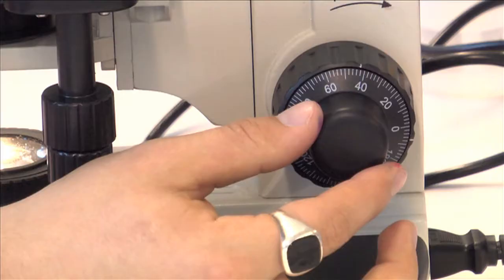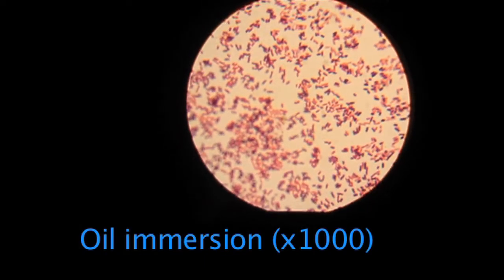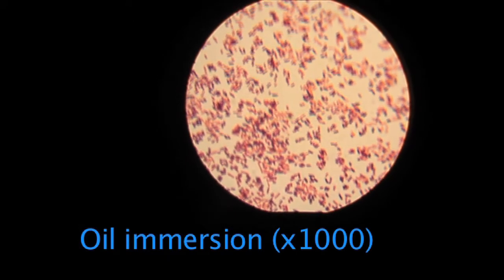This allows for a x1000 magnification. You should only be using the fine focus at this stage.